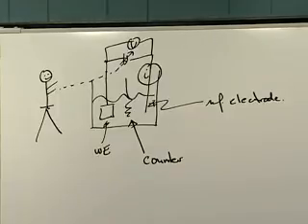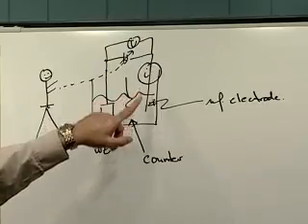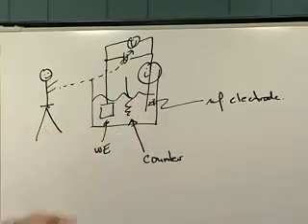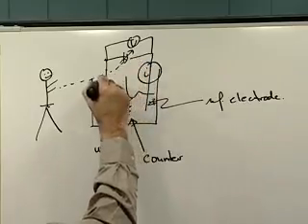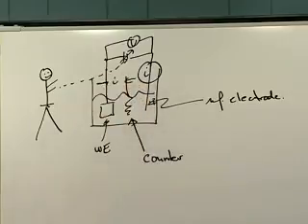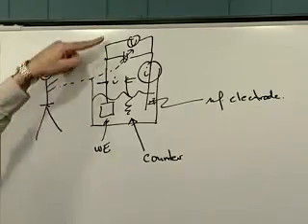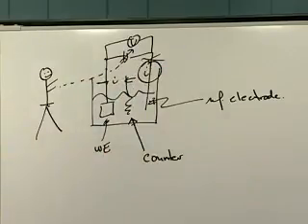Okay. And what we're actually interested in is not the current between the reference electrode and the working electrode, but the current between these two electrodes, the counter and the working electrode. That is, we want to pass our major current through those two electrodes, not through this circuit. So I want to get rid of this part of the circuit and just use that part of the circuit for voltage sensing. So let me redraw this a little bit.